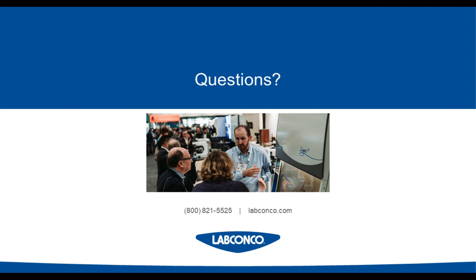Thank you for that. And the number of users, David, is it safe to have 2 users using a BSC at one time? It's certainly not recommended. You have to consider multiple things. One, the size of the BSC, especially if you were to put 2 users crowded together, will impact and restrict a lot of the free-flowing air, both downflow air and inflow air.